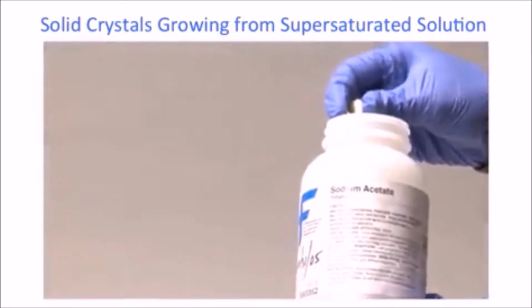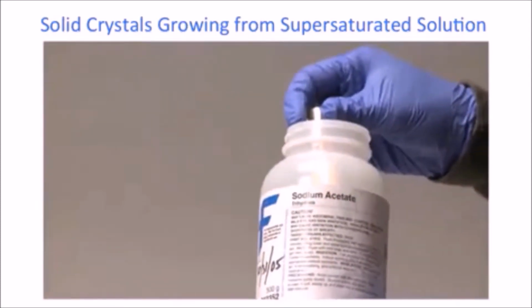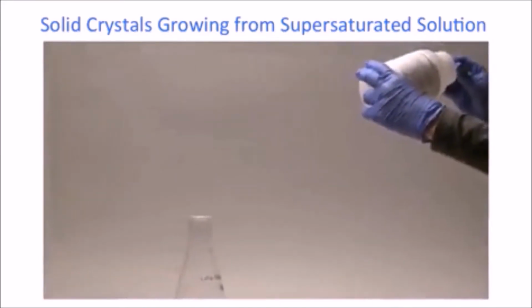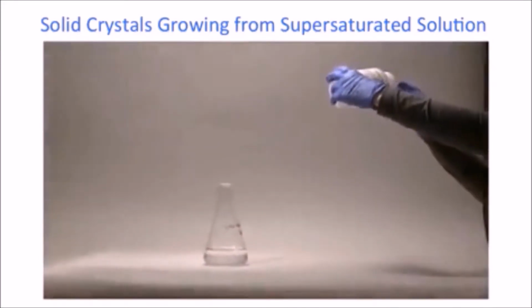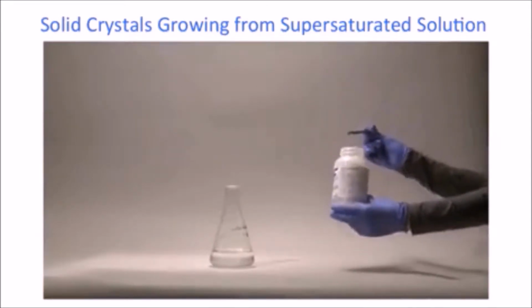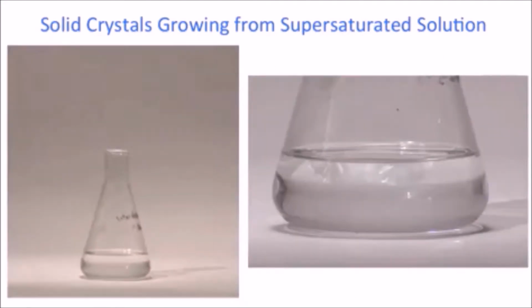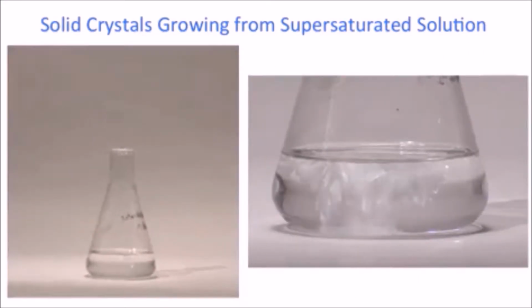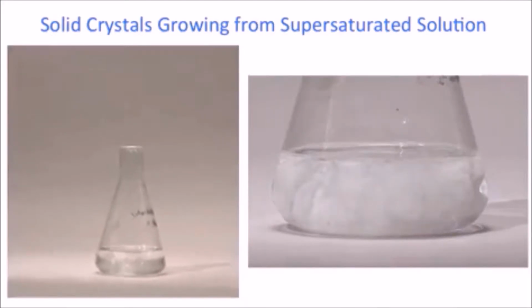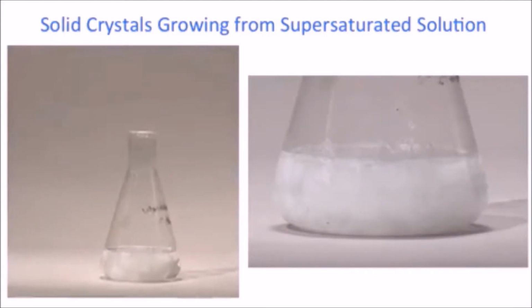Let us take the example of salt crystals growing from a supersaturated solution. In this demonstration, sodium acetate crystals will be growing rapidly from the supersaturated solution of sodium acetate, which is in liquid state. We are adding a tiny amount, say a pinch, of sodium acetate salt into the supersaturated solution. Isn't it fascinating to see these crystals growing? A close-up view of crystal growing is in the right hand side picture.